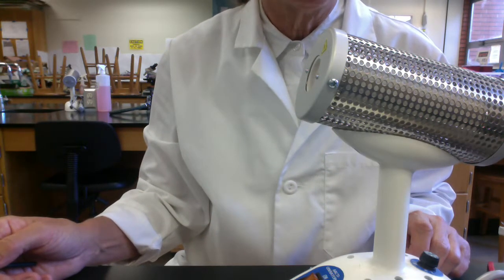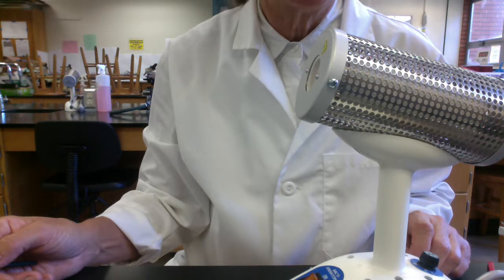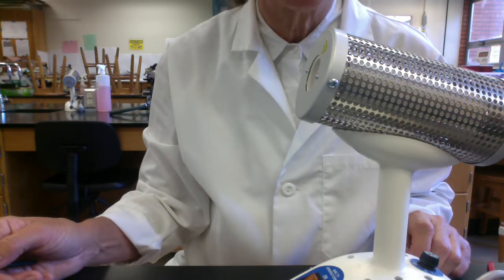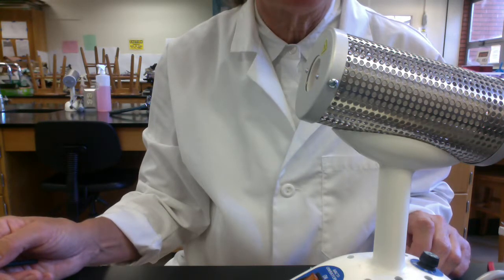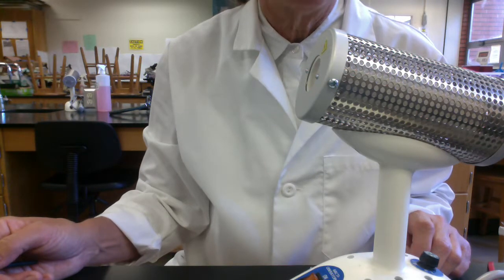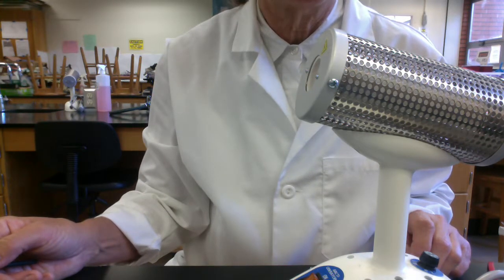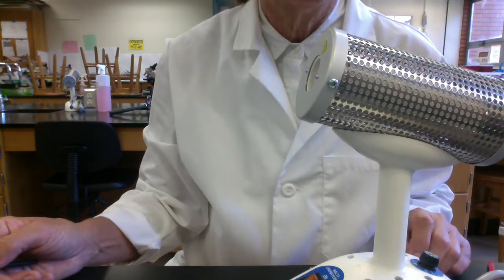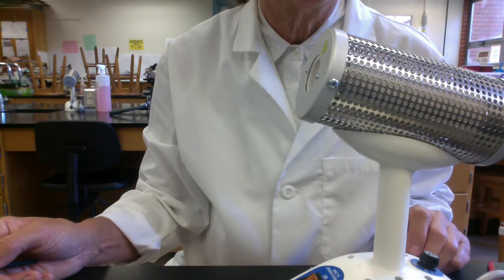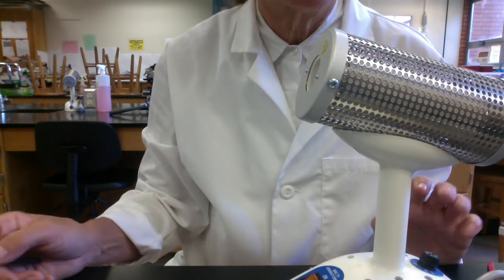You might recall that when we develop good aseptic technique or sterile technique, these are steps we take to prevent contamination of equipment or media with unwanted environmental microbes. We know from the first week doing our environmental sampling, microbes are everywhere on every surface or all over our body.